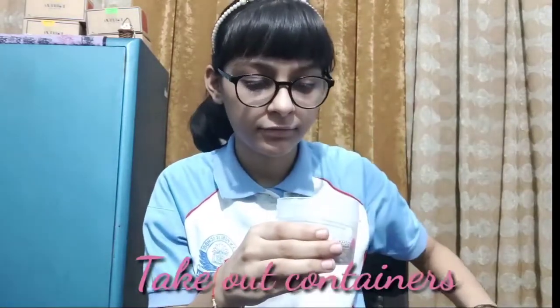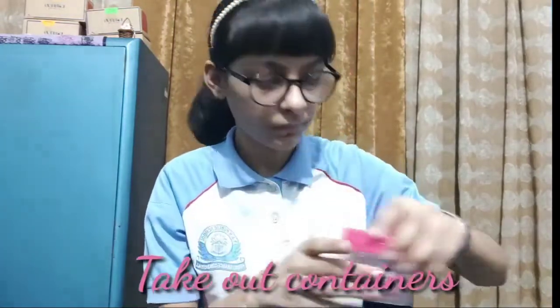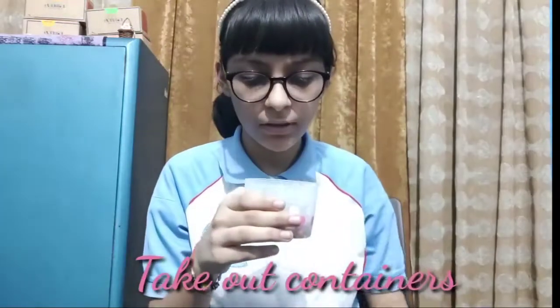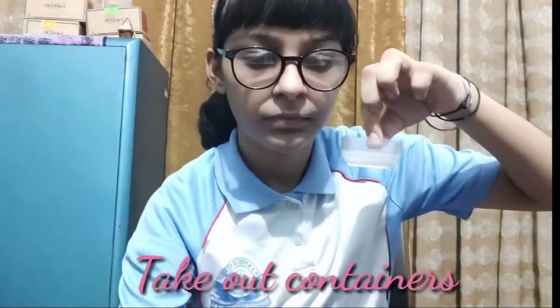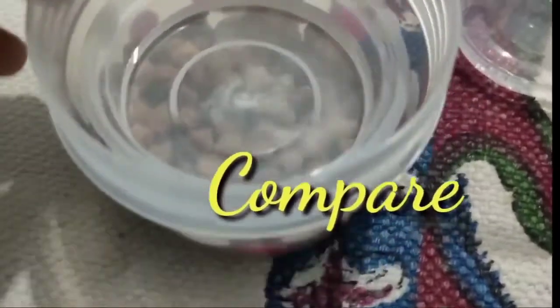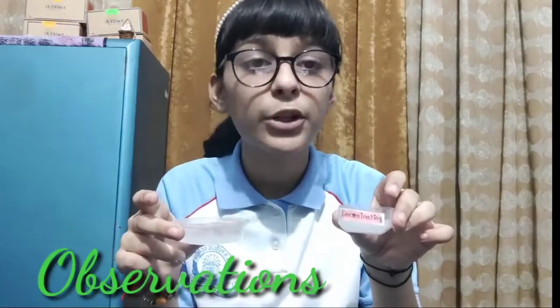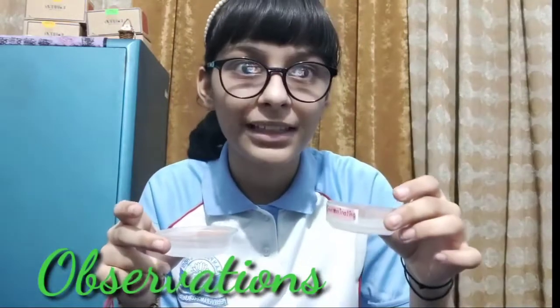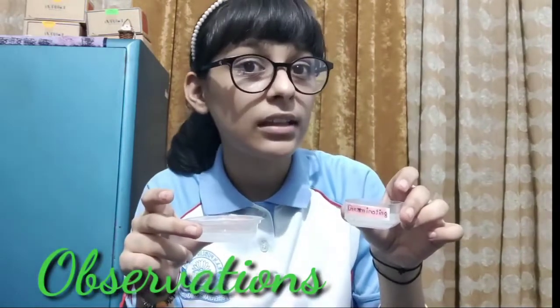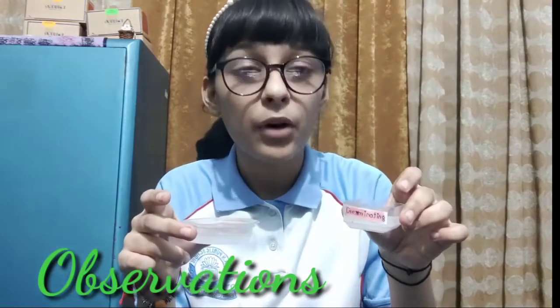After two days, let's observe what changes occur. Open the jar and take out the small beaker, then take out the other beaker from the second jar. You could easily observe that the lime water present in the germinating seeds jar has turned milky. This proves that the rate of respiration in the germinating seeds is more than the rate of respiration in the non-germinating seeds. This also proves that CO2, carbon dioxide, is liberated in the process of respiration.